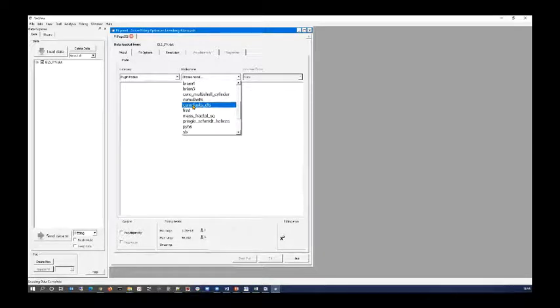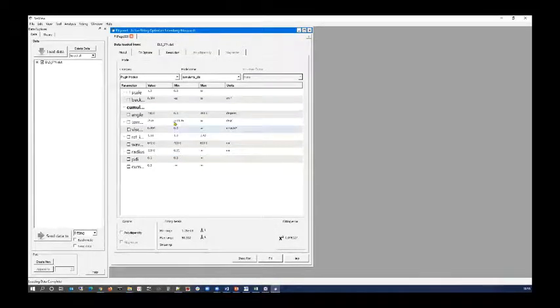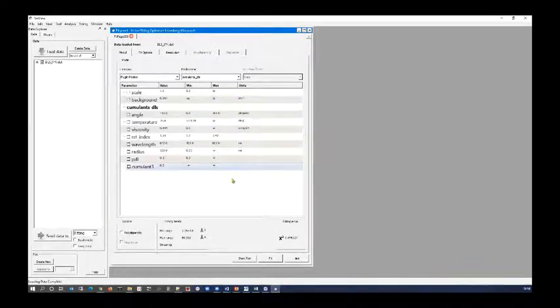So I've downloaded it from the model marketplace, installed it in my SasView plugins folder, and the model is available to me. Okay, and you can see it allows me to set the scattering angle and temperature, all those things that are used to derive the size.